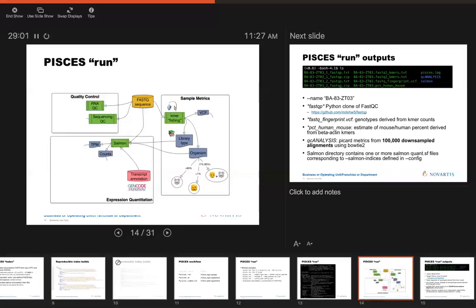Typically, it's not bad enough that it affects your call in a way that you have a heterozygote call that becomes homozygous. Sometimes it does. In that case, you may have one SNP out of, in this case, 226 that converts. That's still good enough to match its genotype against another database of sample genotypes and get a high confidence match.